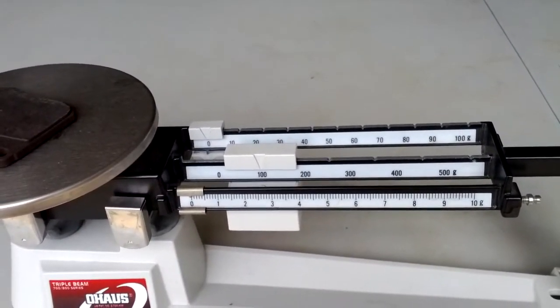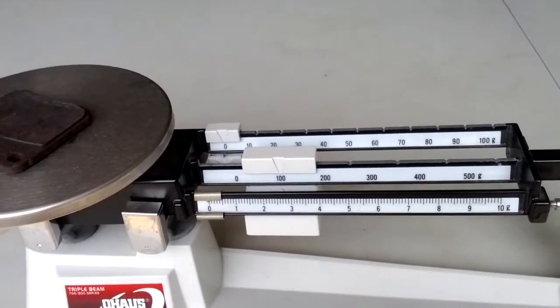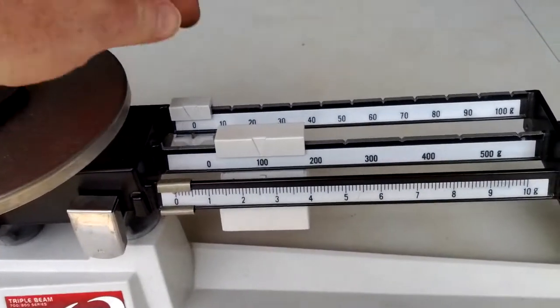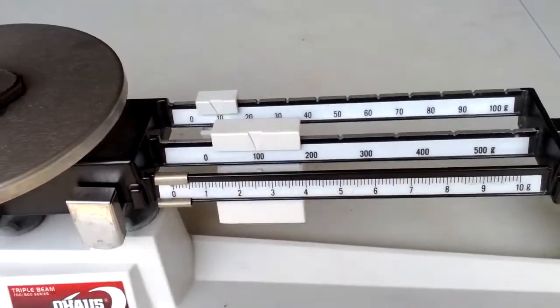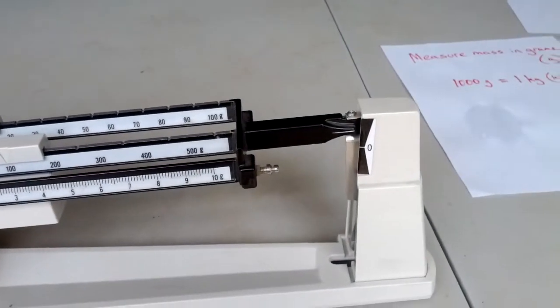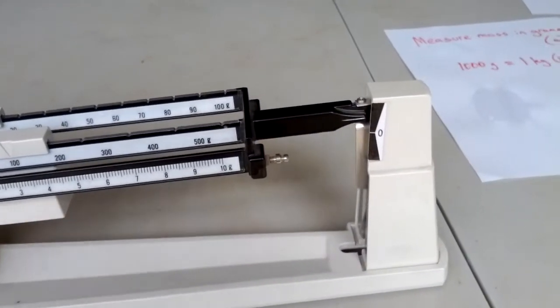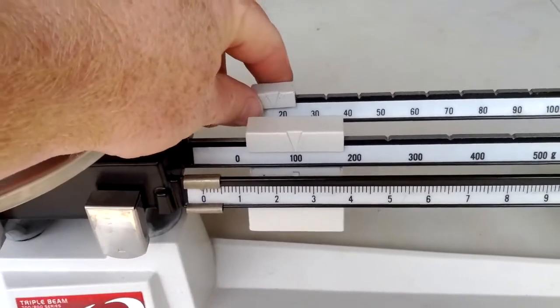Once you've got the hundreds set, now you need to set the tens. So you slide the 10 over one notch to the 10. Make sure the arrow is pointing right at the 10. And when I slide it to 10, I'm still all the way to the top. See how that works? It's all the way at the top.